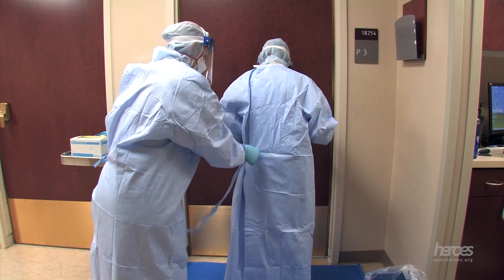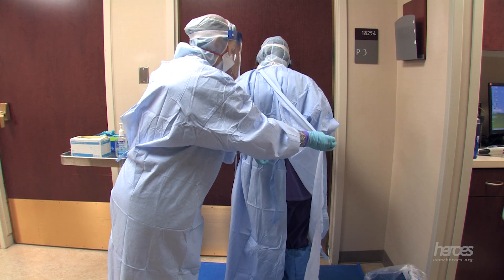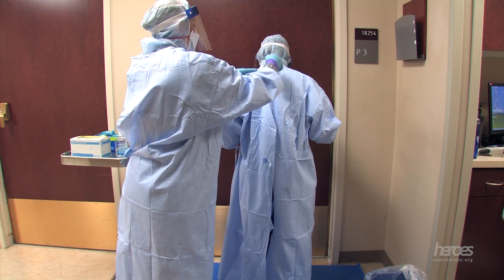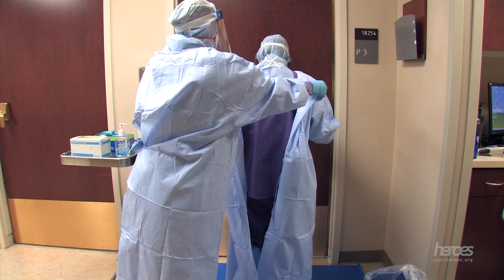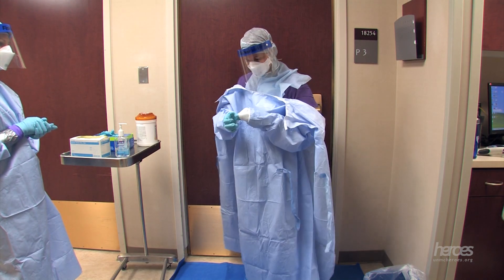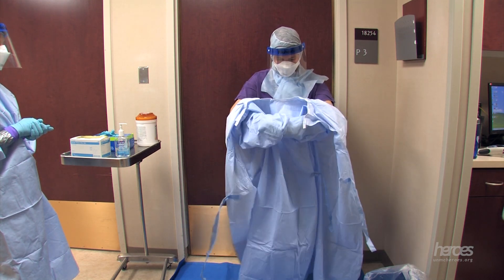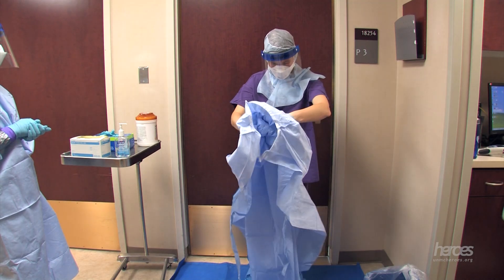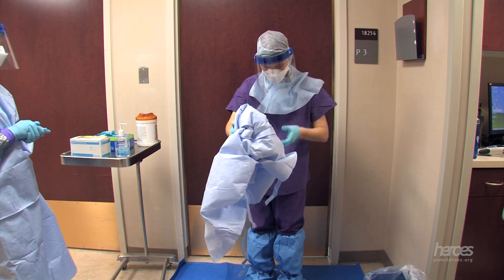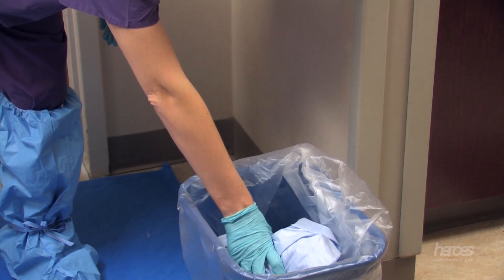The doffing partner then unties the gown at the waist and then at the neck. The doffing partner then rolls the shoulders of the gown forward. The doffer begins gently rolling the gown into a ball. Keep clean gown sleeves over your gloved hands as much as possible to prevent contamination of the gloved fingers as you gather the gown, keeping the soiled surfaces to the inside, rolling it up gently. When the gown is fully balled up, gently place it in the trash.